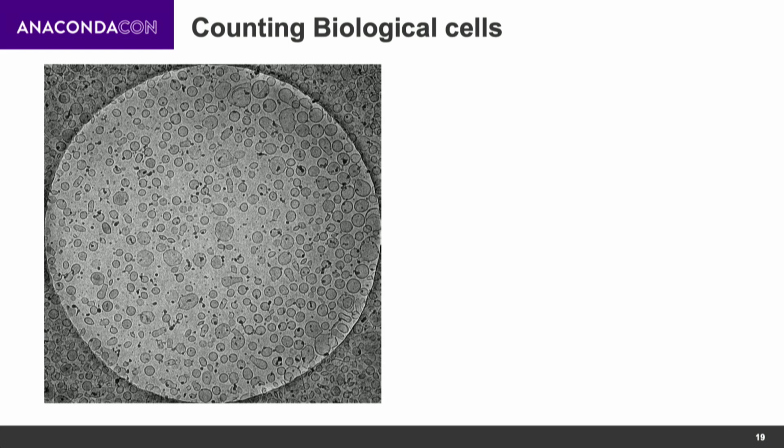And to ensure a similarity of this drug with the innovator, they have to do the composition verification. Assuming the shape 1 is 60%, you check whether it is a similar composition for the innovator drug also. So this, they have to do it across hundreds or thousands of images. And it's a largely manual process, painful.